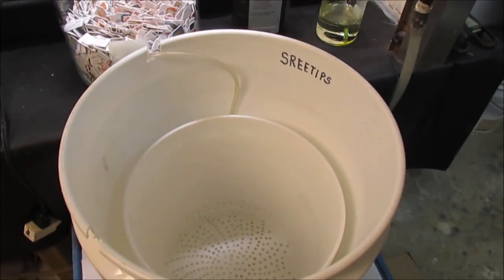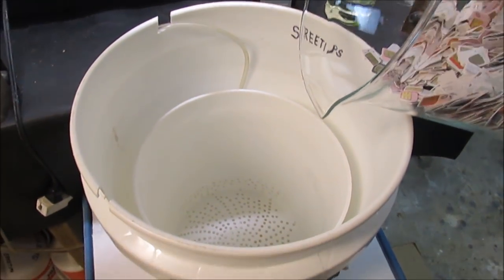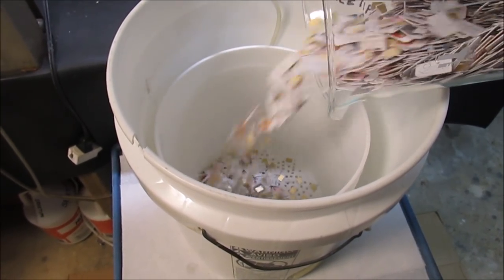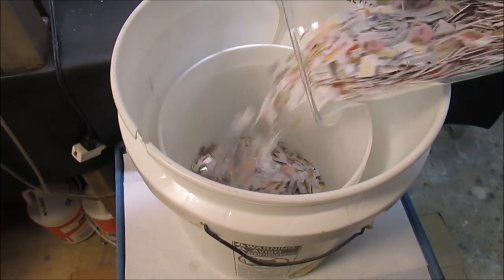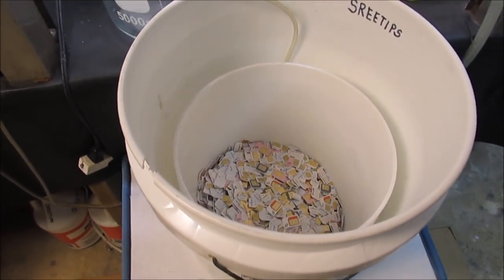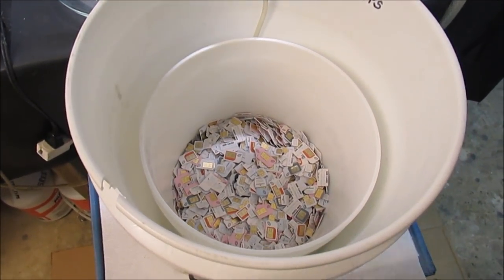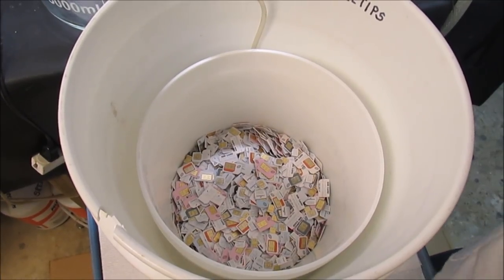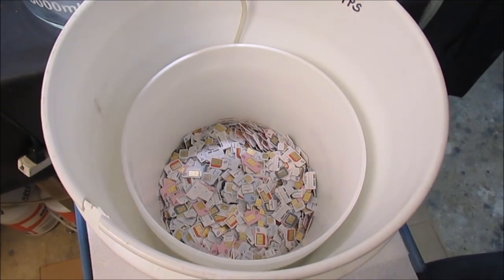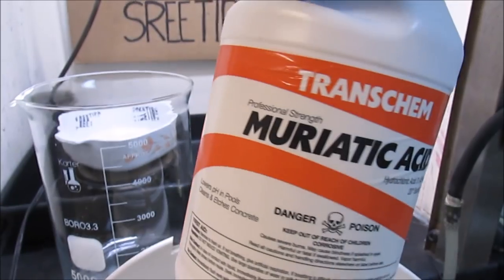And now what we're going to do is pour these SIM cards in carefully. If I can do this one-handed, I'll show you on the camera here. All right, there's all our SIM cards. And now what I'm going to do is add some hydrochloric acid here, so I can just cover them up. Hydrochloric acid.